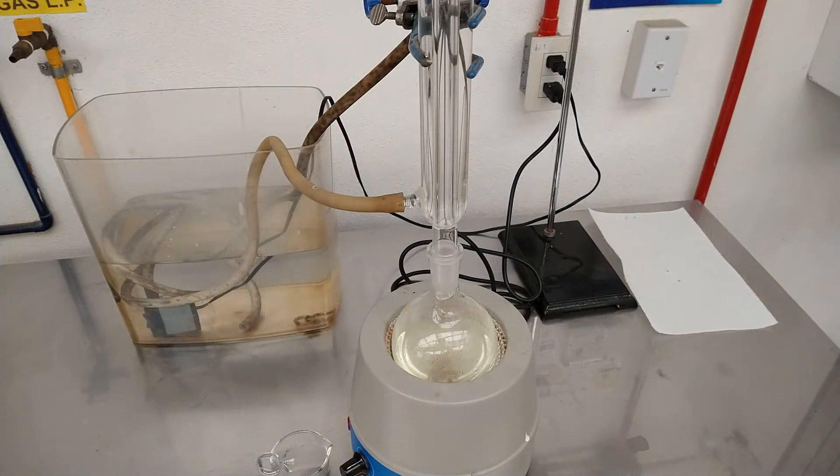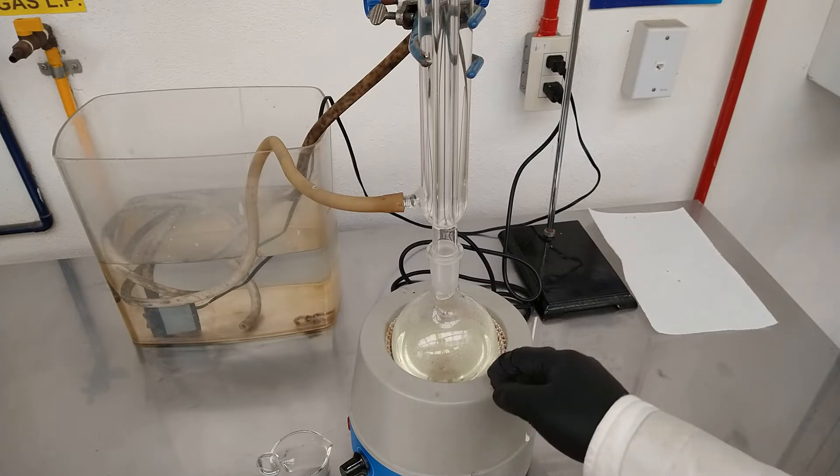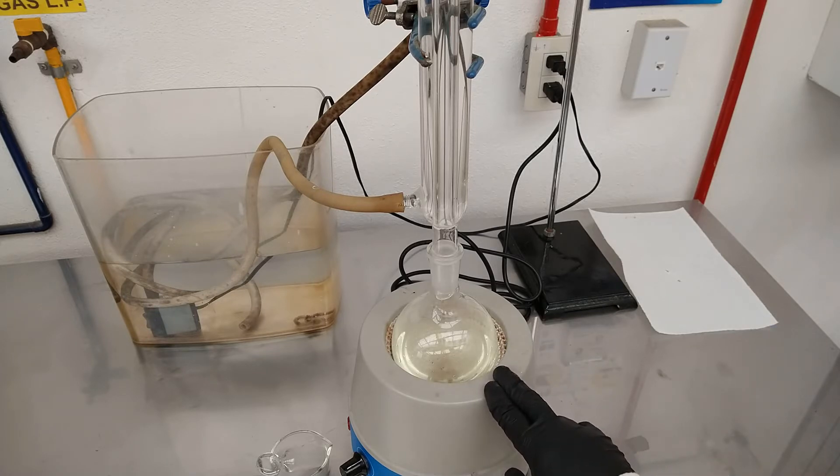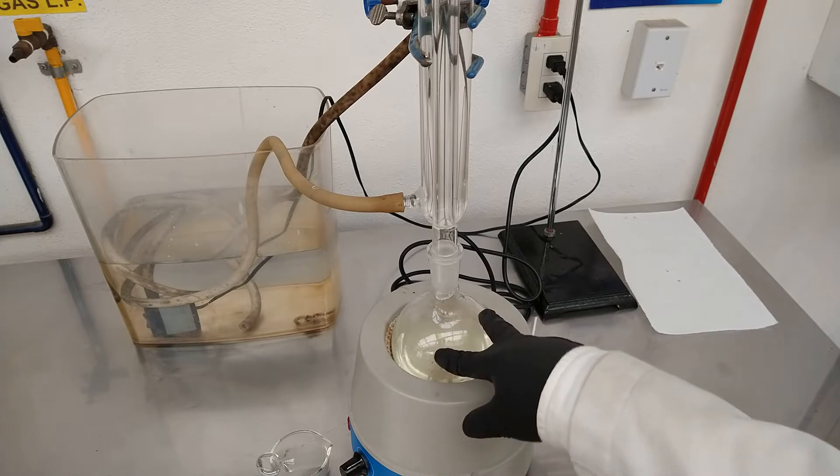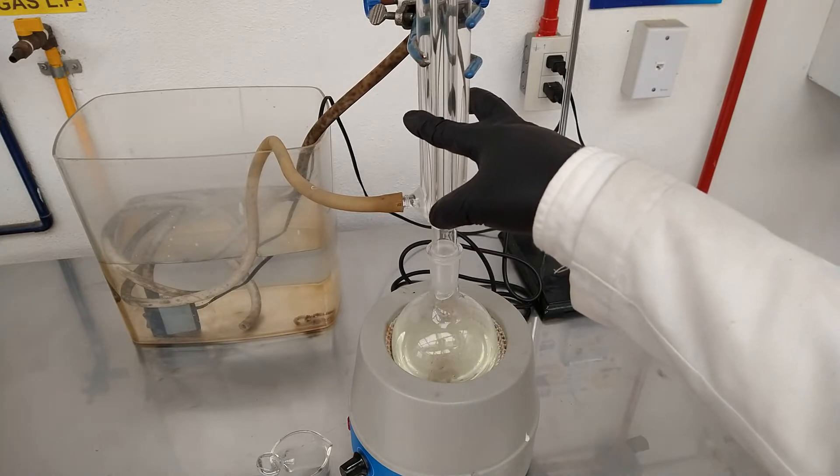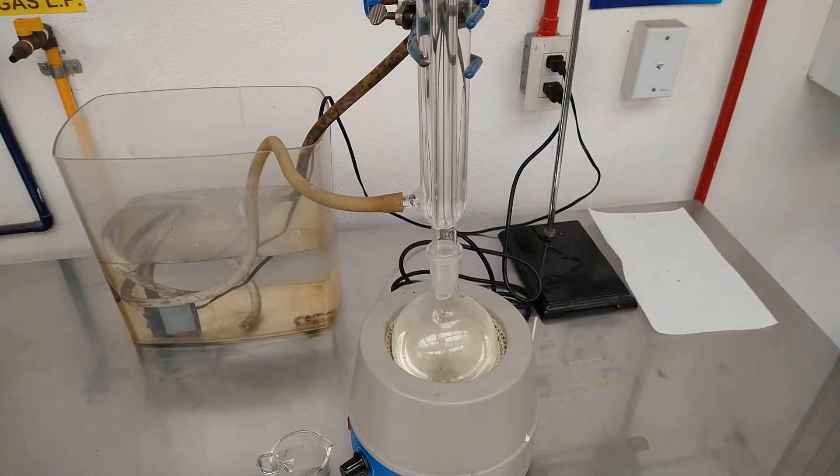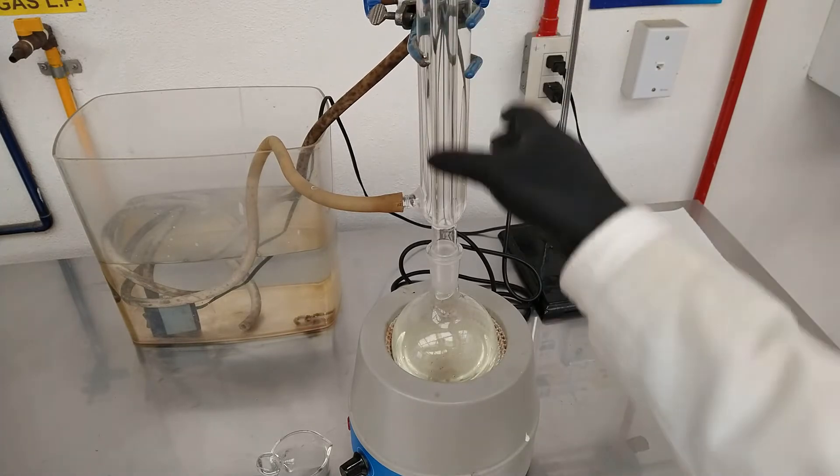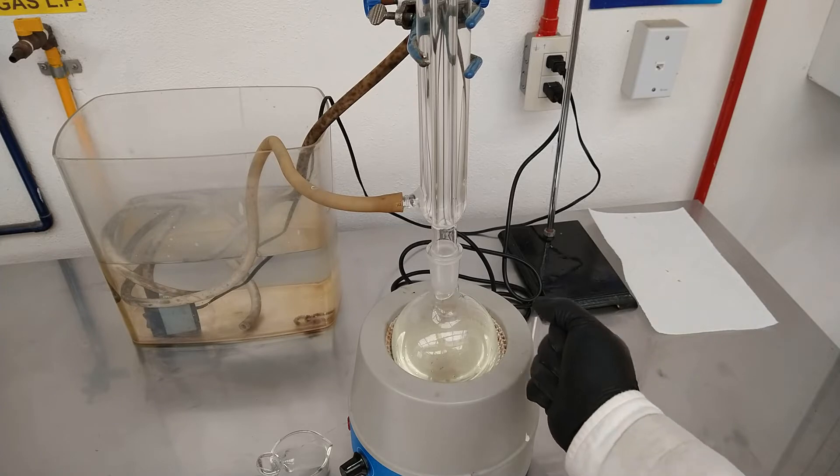So now that all of the reagents have been added, we can begin the refluxing of the reaction for 8 hours. So this is our setup. We have our flask, our condenser, the pump and the heating mantle. So we add a couple of boiling chips to prevent sudden boiling.